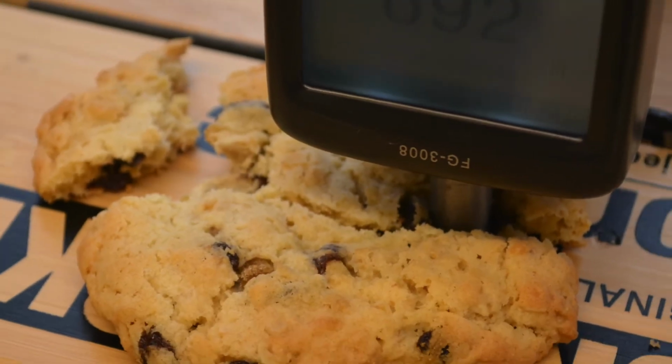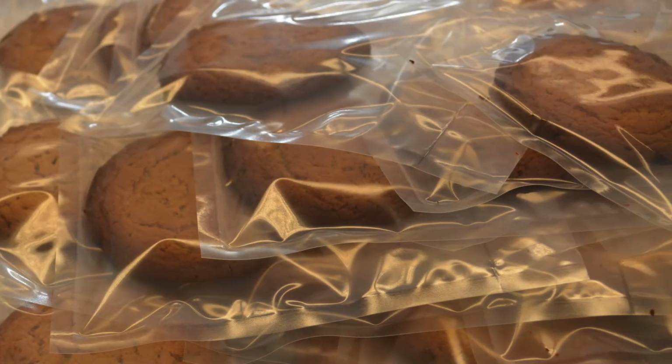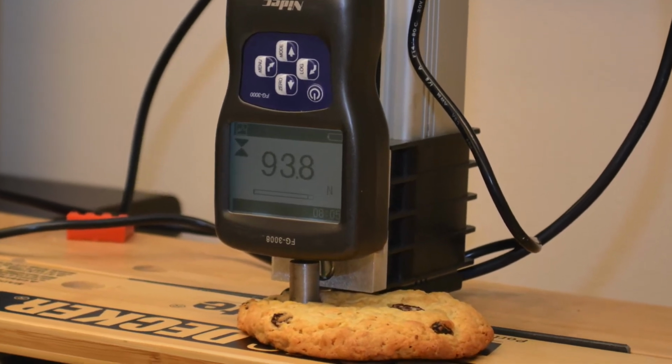This texturometer can be used for a wide variety of food and ag products. Like I mentioned earlier, it can be used to help evaluate shelf life. So for example, a cookie gets stale and becomes brittle, it becomes hard. This machine can be used to test the hardness. We can put numbers to the idea of staleness.